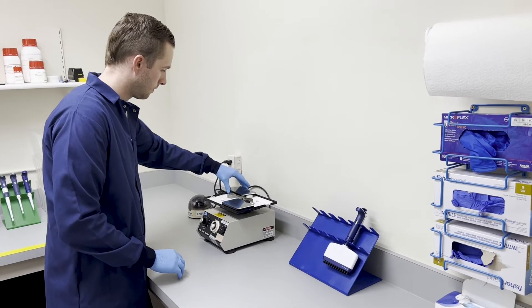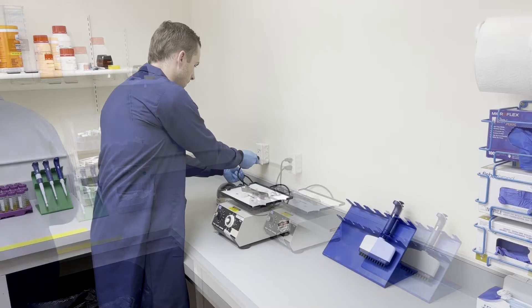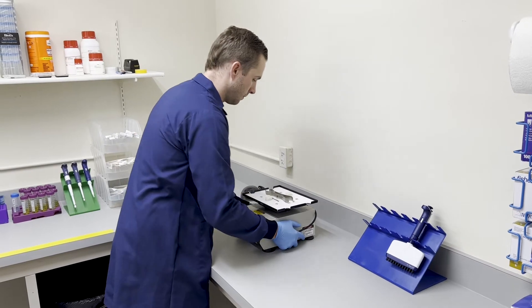To assemble the imager, first find a stable space on the bench free from vibrations. Stability ensures data is of the highest quality.